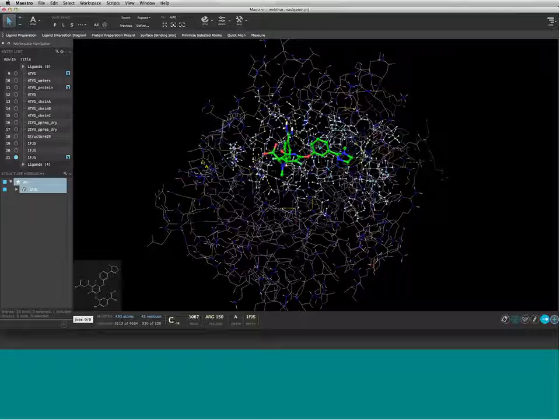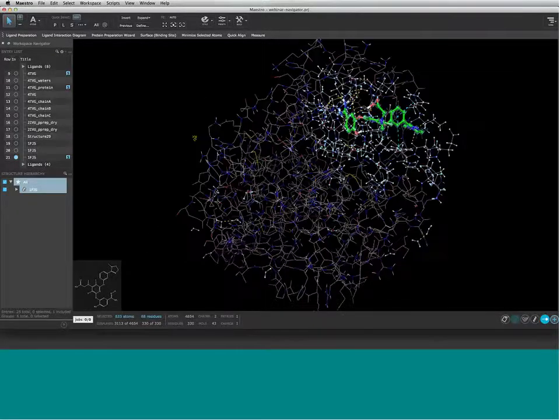So we've talked about advanced techniques for picking. Now we can look at using advanced techniques with the quick select objects. I think we've talked about this already, but I'm going to go over it again. For instance, say you wanted to select your binding site, your ligand, and all your waters in order to style them a certain way. You can say binding site and ligand here, that's easy. But how would you add waters? Well, you say plus. You're in the add mode here. And then you say waters. And now you can see some waters here.